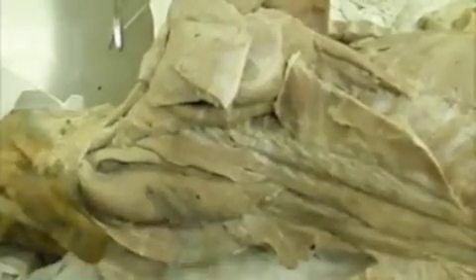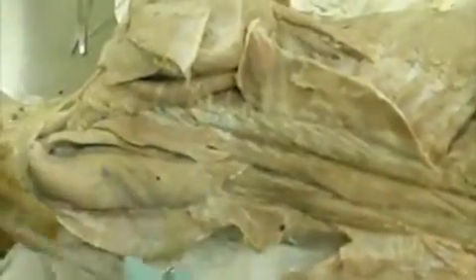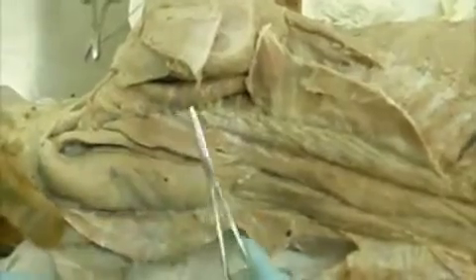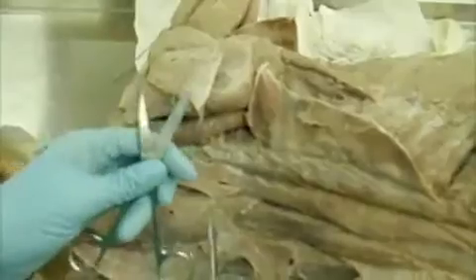Also, this specimen has been really cleaned up. I've removed a lot of fat from it. So one of the first things you want to do when you get a specimen and you're doing the back, especially in dogs that are a little overweight, there's going to be a lot of fat on it, so you really have to clean and remove a lot of fat. I suggest you use forceps for that. Do not use blades. They often cut into muscle when you're not expecting it. Forceps are a great tool to remove fat, and so are scissors.